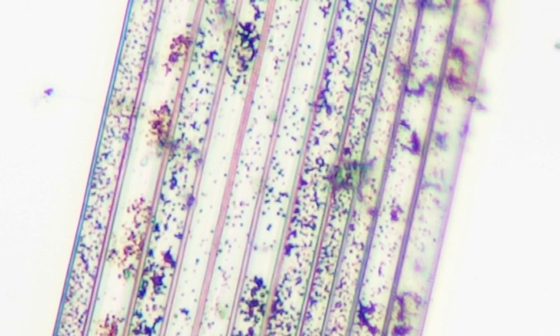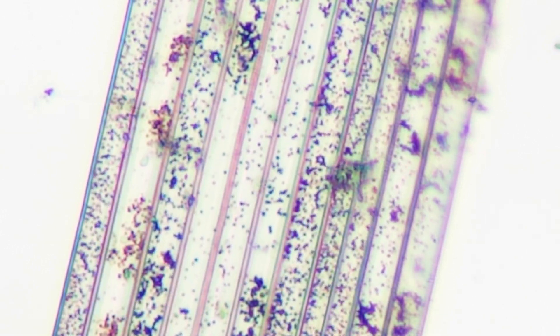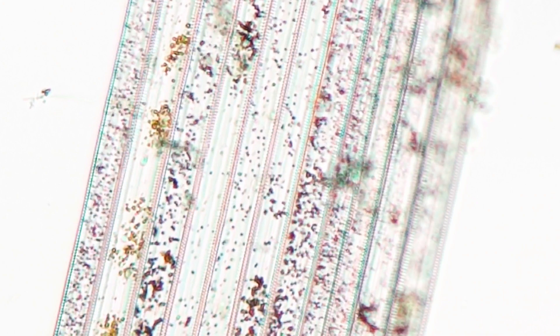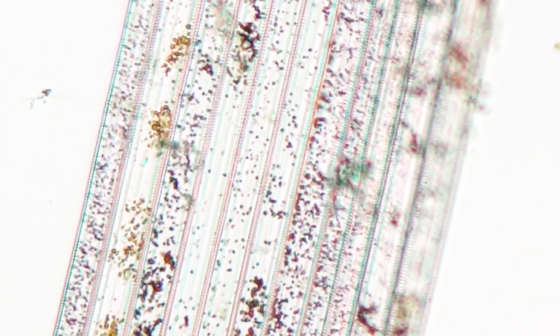This lens has a low numerical aperture, and this lens has a high numerical aperture. Higher numerical aperture lenses get you more detail.